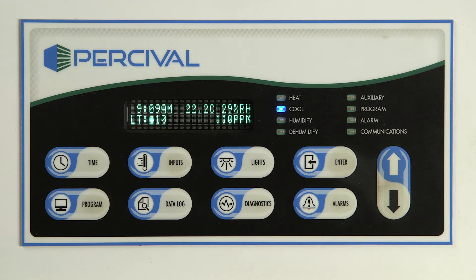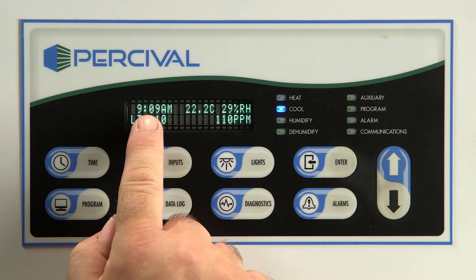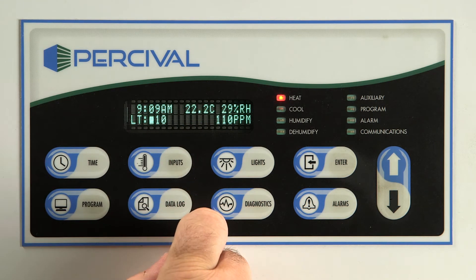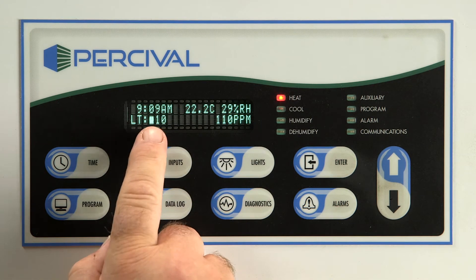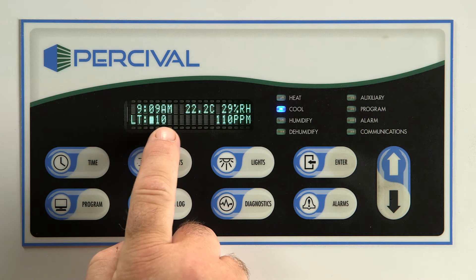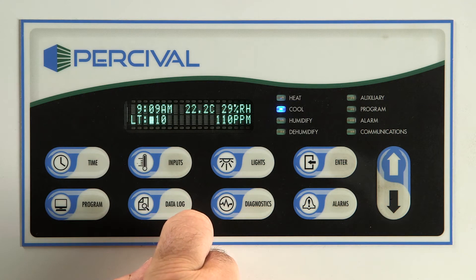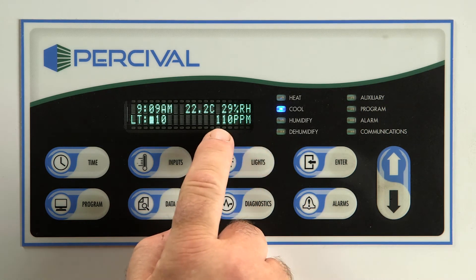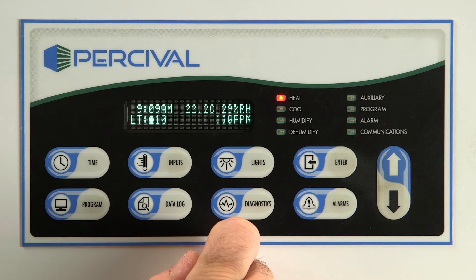The controller's display is on the top left of the controller. The top row displays the current time, the chamber temperature, and finally the relative humidity value. The bottom row displays the light settings, either a bar graph for the open loop dimming feature or a 1 or 0 — 1 is on and 0 is off. The bottom row also shows the auxiliary channel, which can display either CO2 concentration or light intensity if equipped with closed loop dimming.